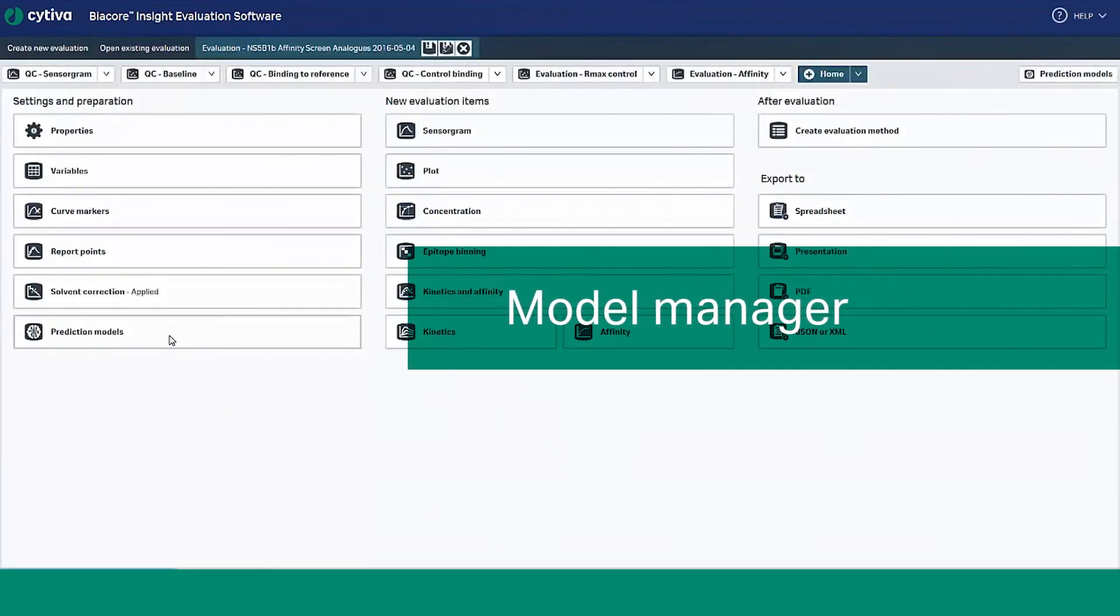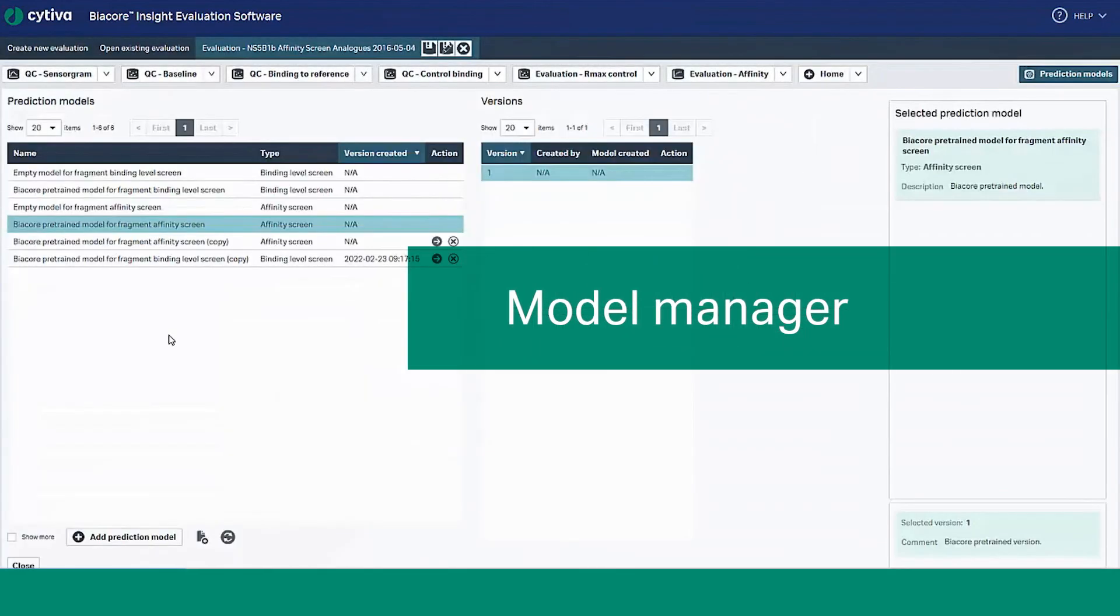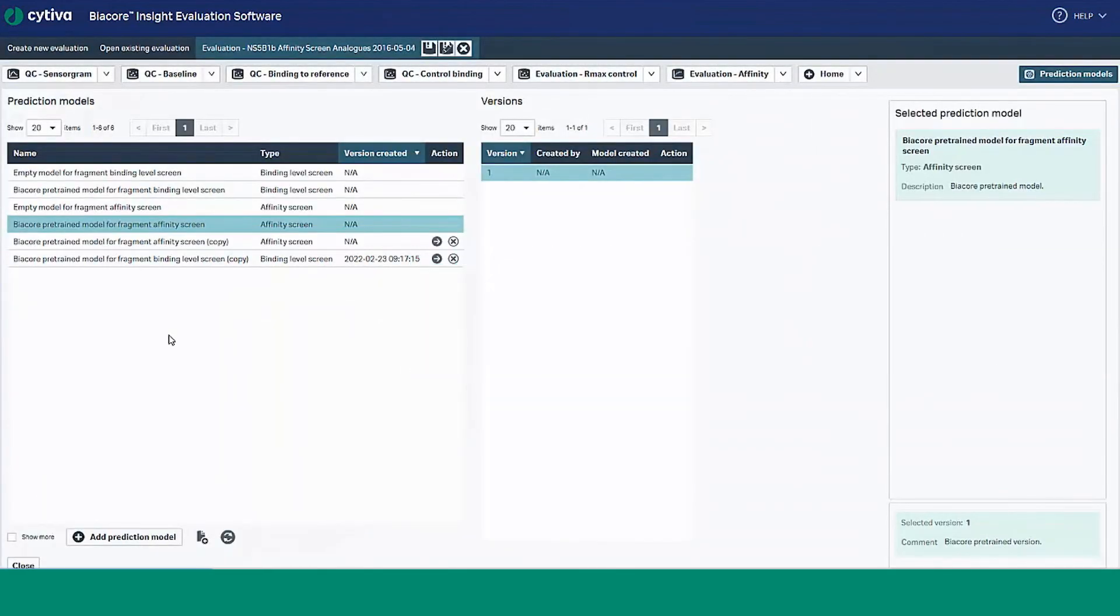Finally, let's take a look at the model manager. This is where you can manage, track, and annotate the prediction models you create.